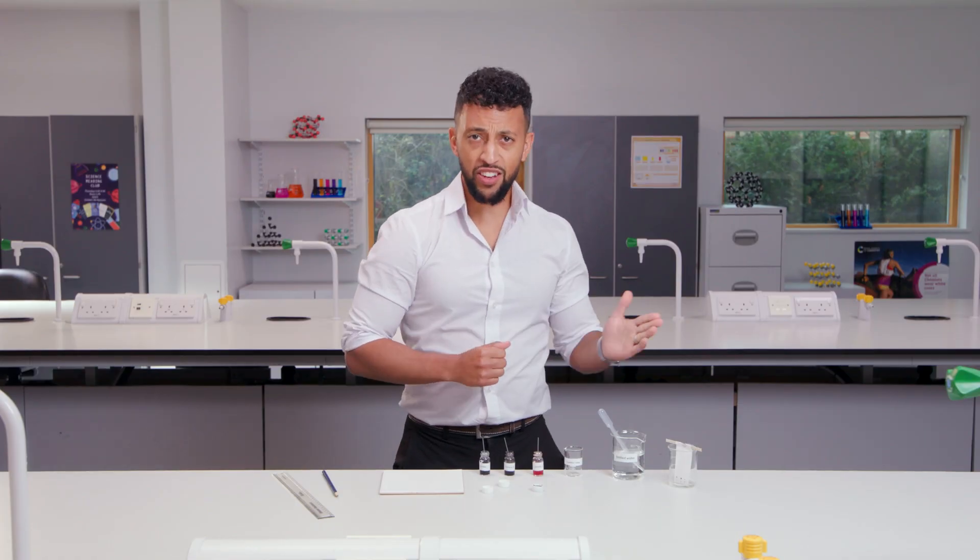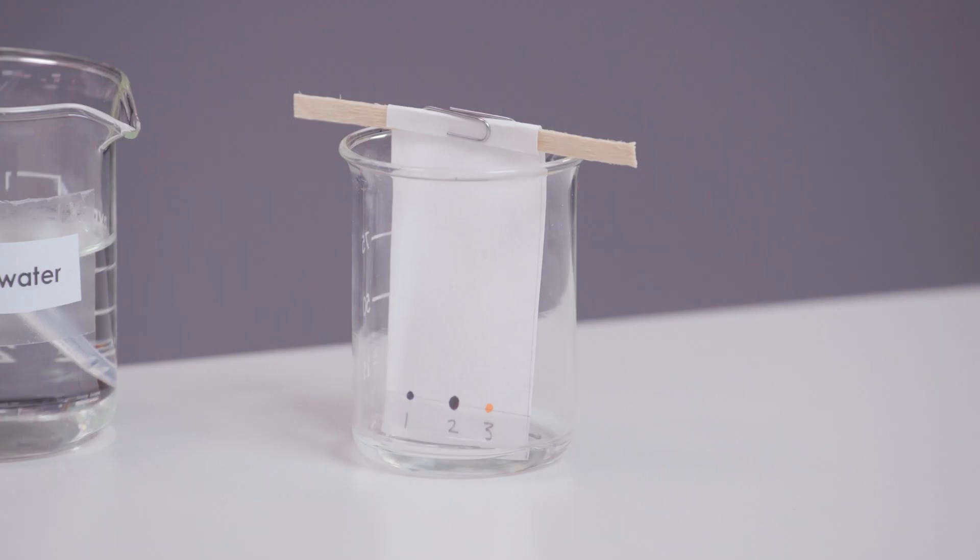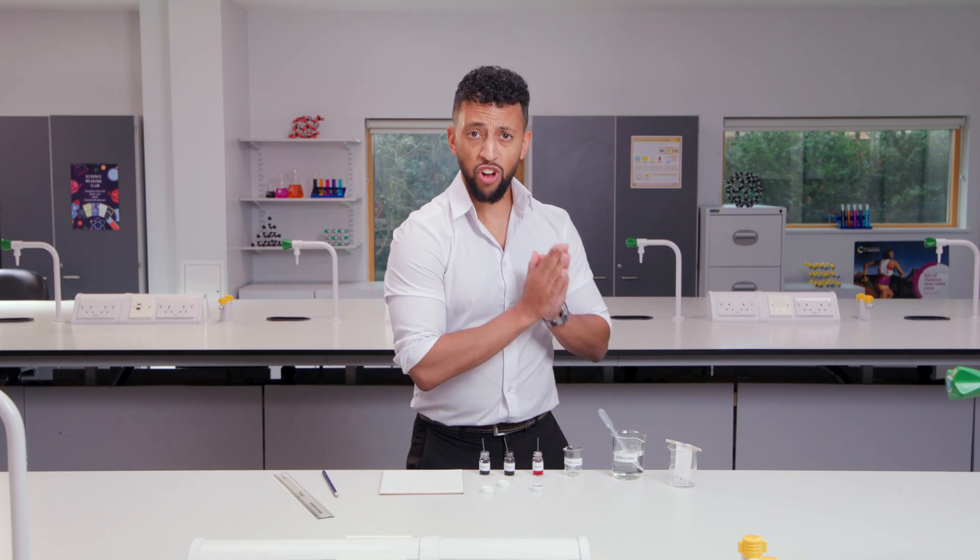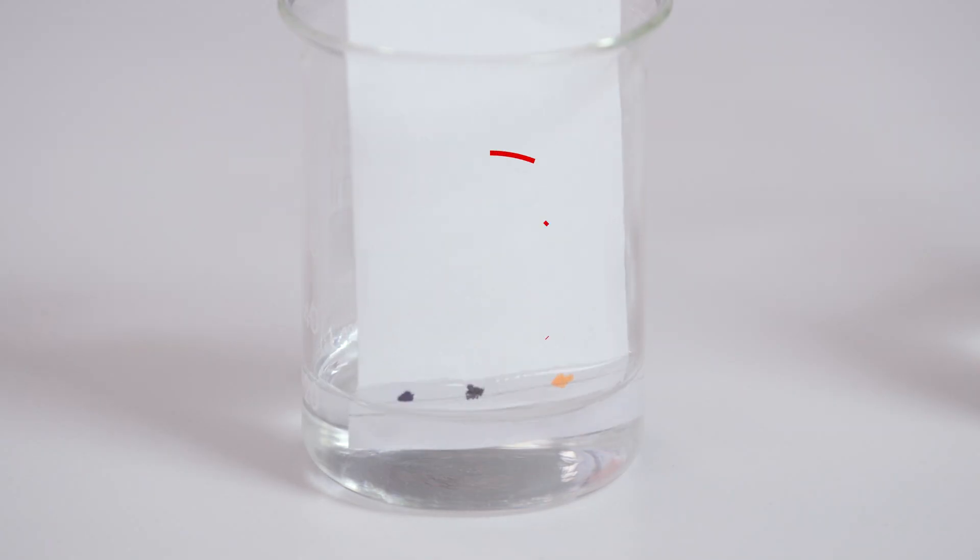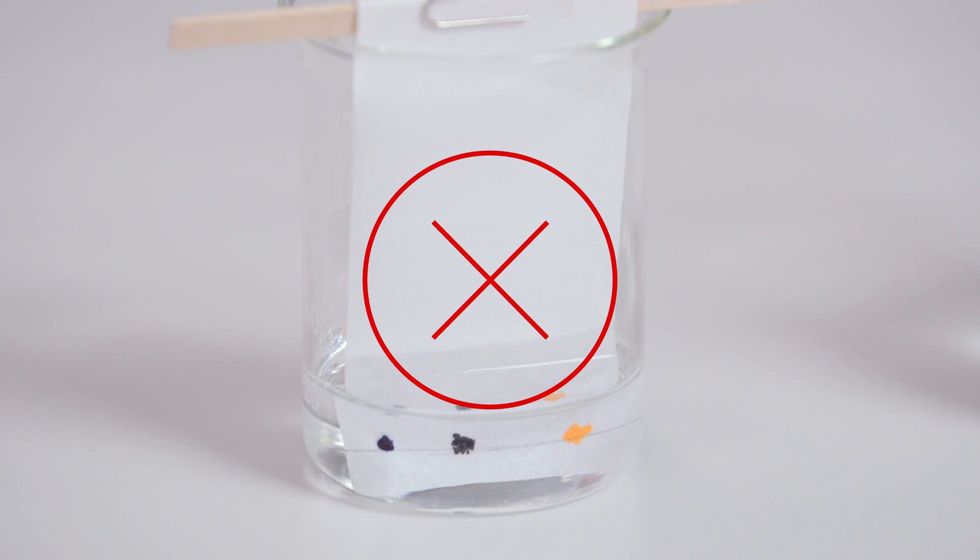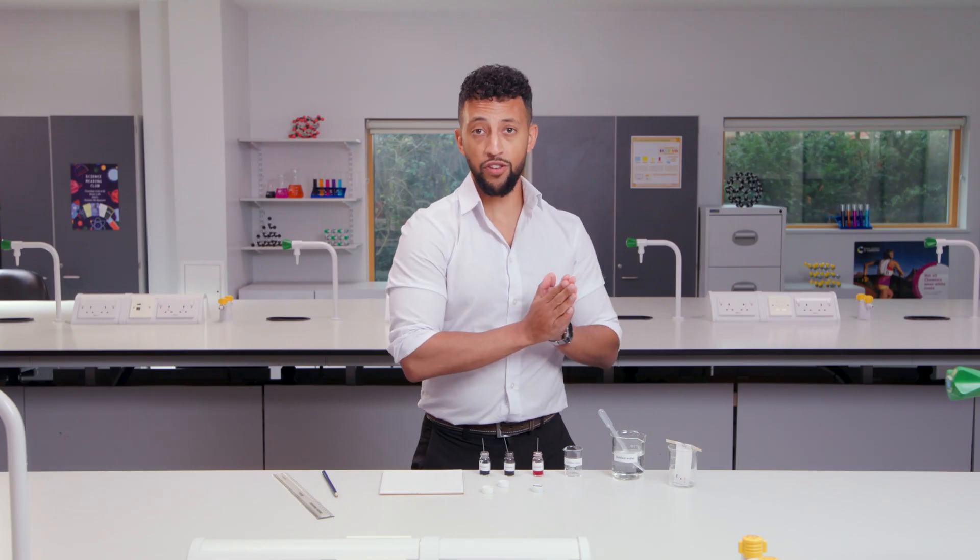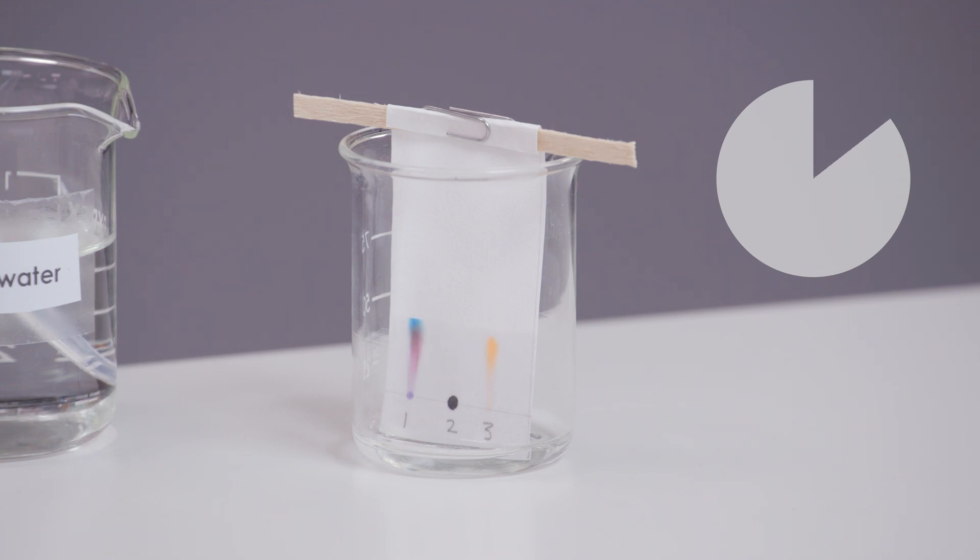You can see that the ink samples on the pencil line are above the water. This is important. If the water level was higher than the ink samples, the soluble samples would dissolve in the water and there'd be none left on the filter paper. I will leave the beaker and its contents until the water has reached just below the paper clip.